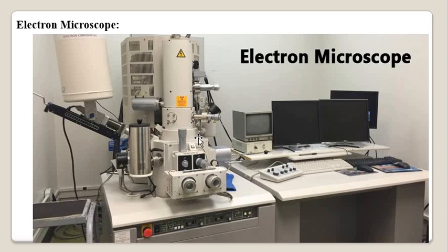Nowadays, modern electron microscopes are equipped with circulating pumps and refrigerators. Circulating pumps and refrigerators come inbuilt with them, and the size is reduced because of the electron system. This electron microscope is a very complex instrument and totally different from the compound microscope on its manufacturing basis. Now, how does it work? How does this electron microscope work? Let's see.